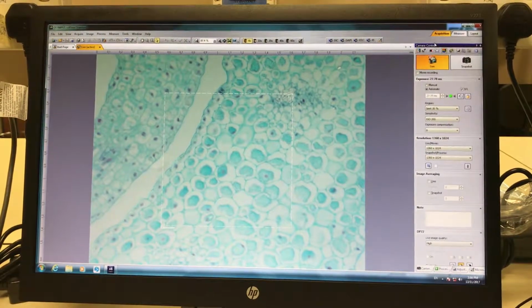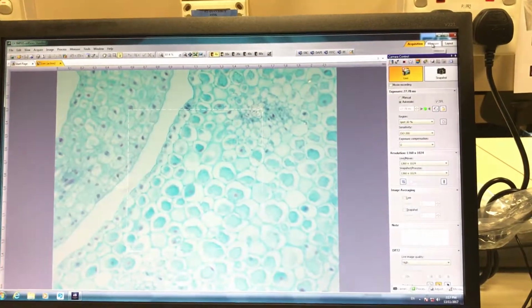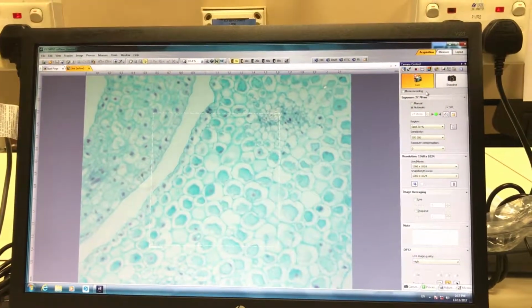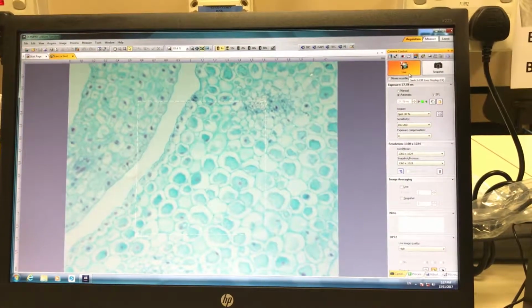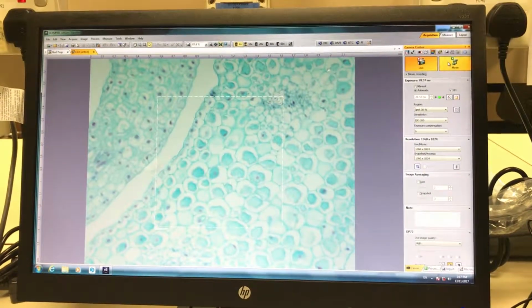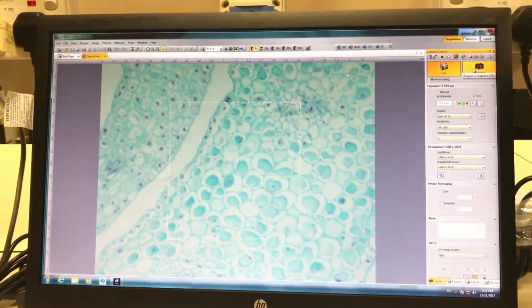Okay, and then in this Fluorescence software, we have 2 layouts. One is the acquisition layout where you can do the image acquisition, and the other, the measurement layout, is for after image acquisition, when you want to do processing and measurement. So you start from the acquisition layout. On the left hand or the right hand side, you get this camera control window. Here is where you can get a live image, and if you want to do a movie recording, check this on. This will turn into a movie button, then you can start or stop the movie from here. Otherwise uncheck it, and this will become snapshot.